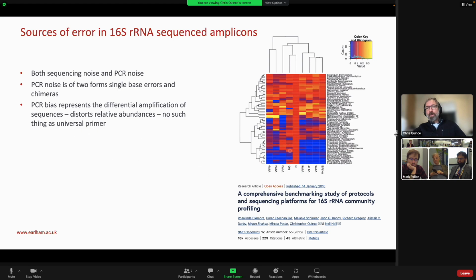We've also actually got metagenomic sequencing in this study, and then this is the true community, which was actually completely even. Now, yeah, so every species should have been present in the same abundance, but that's not what you see. So for this region, V3, V4, we see far more than we would expect of these organisms. And this is caused by PCR bias.